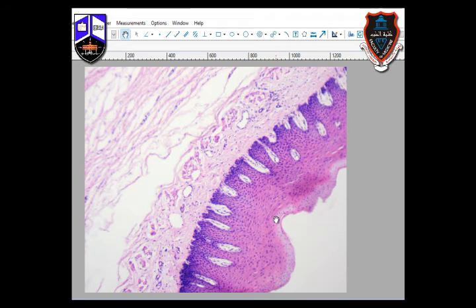Okay, again, this is our epithelium, this is our lamina propria, and this is our submucosa. You can see here the arrangement of fibers. The percentages of cells, fibers, and the ground substance are more or less equal. You can see many cells that contain nuclei and many collagen fibers. Let's see in the higher field.